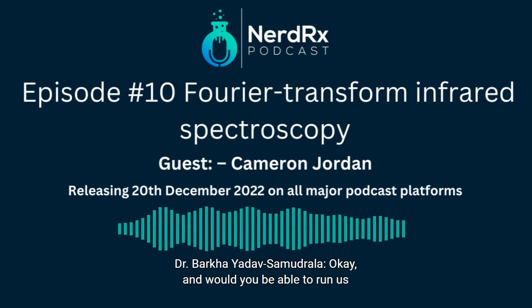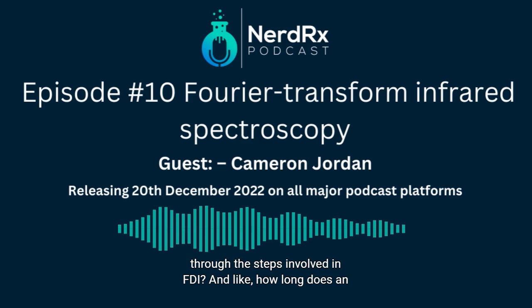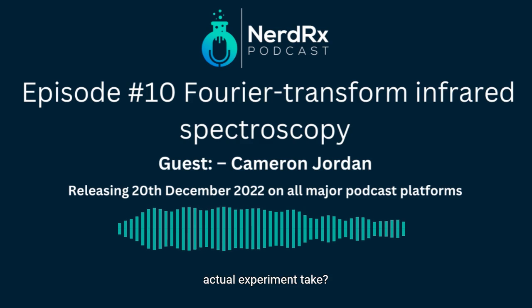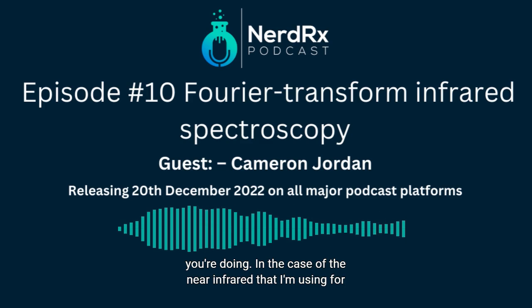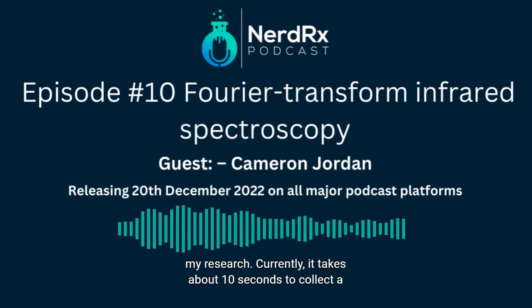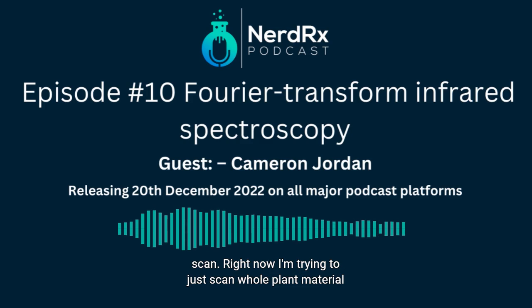Okay. And would you be able to run us through the steps involved in FTIR? Like, how long does an actual experiment take? Yeah, so it depends on the type of FTIR you're doing. In the case of the near infrared that I'm using for my research currently, it takes about 10 seconds to collect a scan.